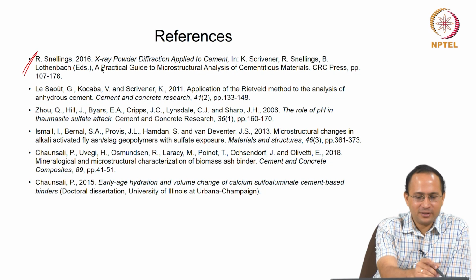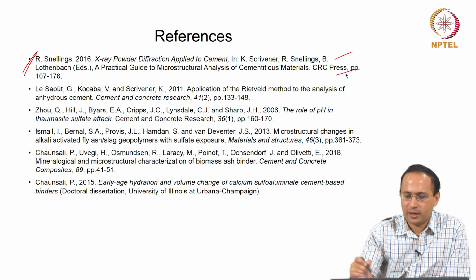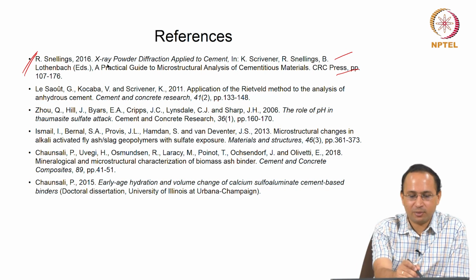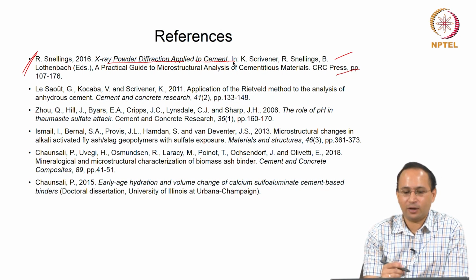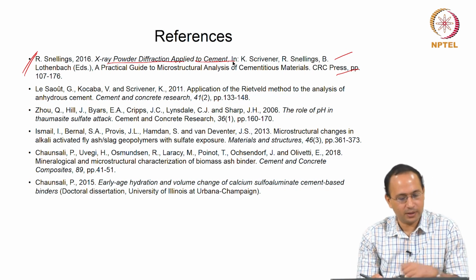These are the references which were used. This is very nice, and we have this book recommended. There is a chapter on X-ray powder diffraction applied to cements, where you will get more insights on how we use X-ray diffraction, and these are some papers which were used for this particular lecture.